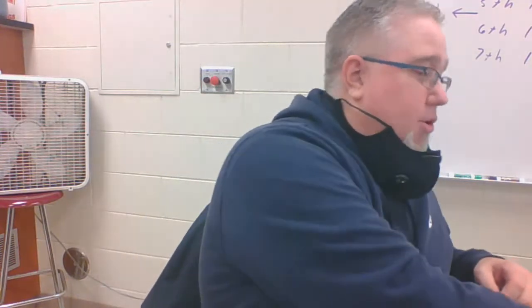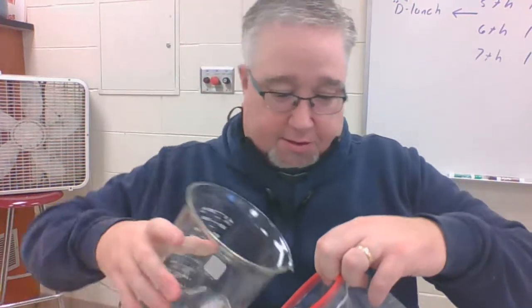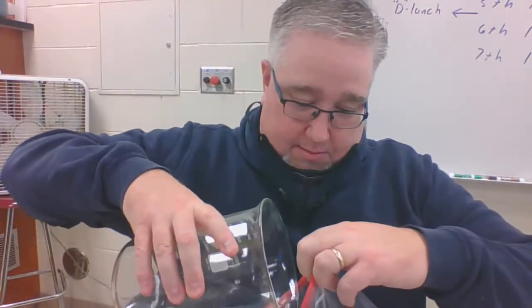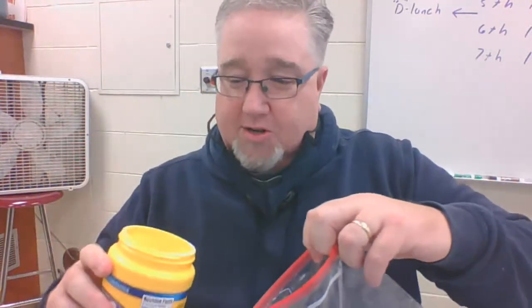Now I'm also going to put in this bag some cornstarch, just some regular cornstarch you might find in your mom's kitchen cabinet. I'm going to pour a little bit more water in here first. That's a little bit better. So I'm going to pour a little bit of this cornstarch in. Cornstarch is a white, powdery substance.